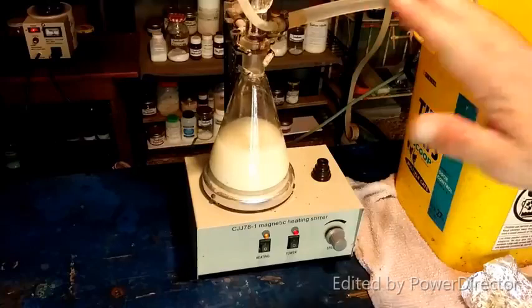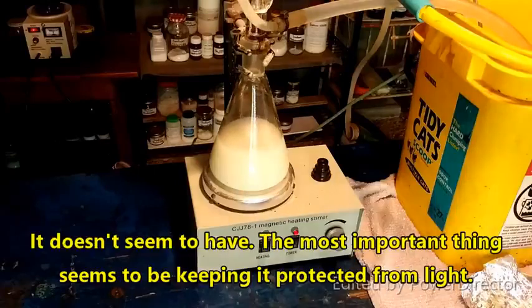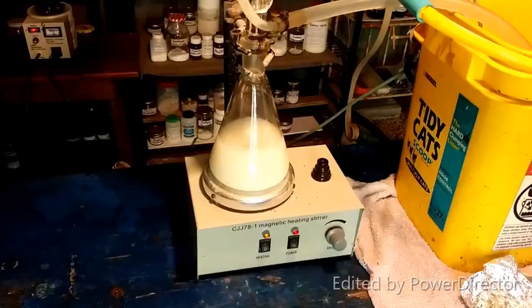So this may end up sitting here after we're done with it for a little bit until I can get everything else in order, and I really hope that doesn't mess my product up, because that thing is like diiodomethane. I mean, my guess is that it's going to be extremely reactive for SN2 reactions. So, yeah, I don't know how wise it is to let it stay mixed with other stuff for any appreciable length of time.